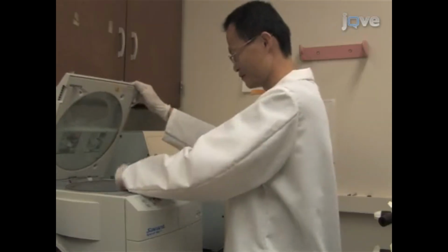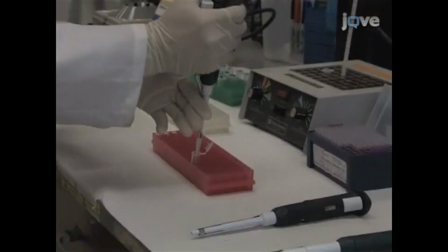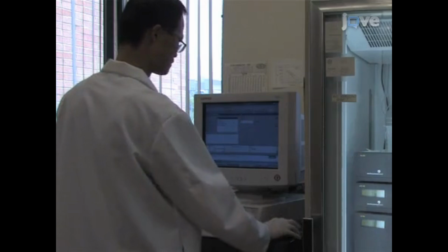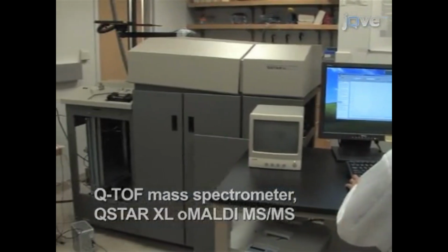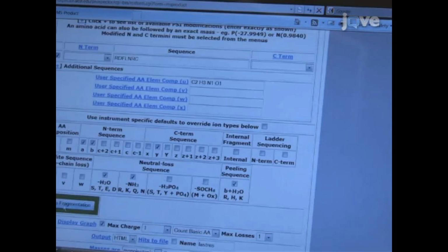After drying the HPLC fractions with a speed vac, resuspend the samples in 5 microliters of acetonitrile and 0.1% TFA at pH 2.5. As an initial screen, analyze each fraction for peptides by MALDI-TOF. For all fractions containing peptides, identify the fragments by tandem mass spectrometry. Use the MS-Product function in Protein Prospector to match daughter ions and the theoretical m/z ratios based on the primary sequence of Pak2.